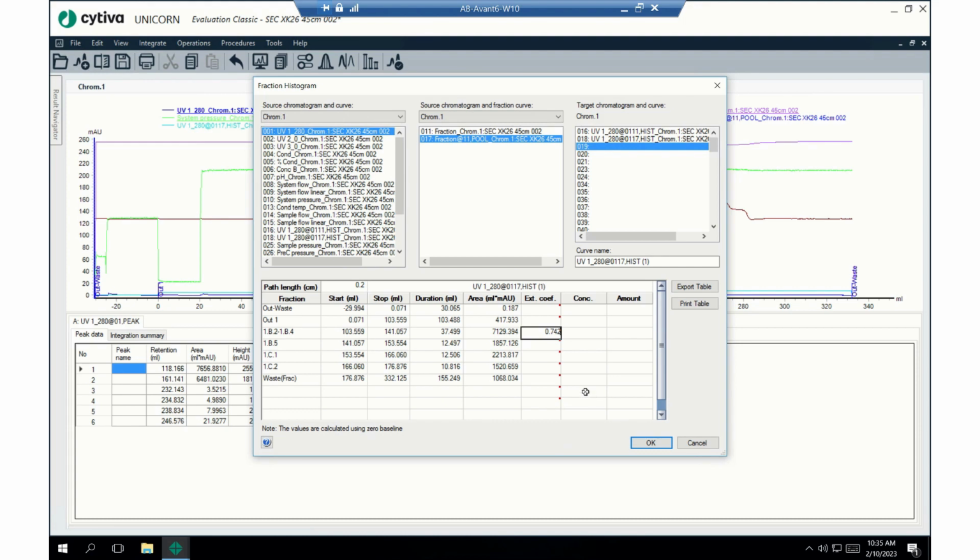Please forgive me if I got it wrong. If you're watching the video and you rewind, come back and forth, and that's not right, it's whatever the calculation is supposed to be. So I'm going to hit enter, and there's my calculation. Okay, it's that easy, folks.